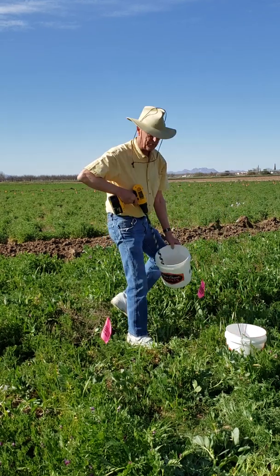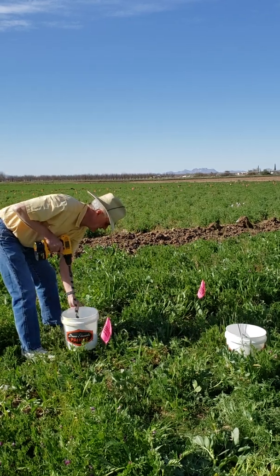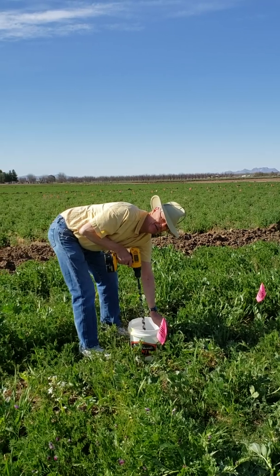I like to take about nine samples around the bucket, to cover any variance you might see in the soils.